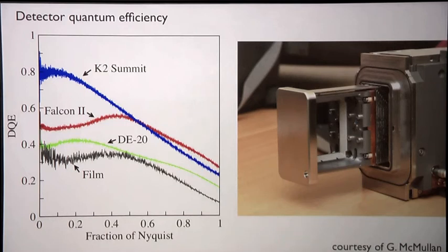I mentioned one other detail. This lower resolution information here is probably quite useful for doing the alignment of particles, and so there may be some advantages to using this one in particular circumstances, but there may be mostly advantages to having the high frequency information here. But as these get better and better, which they will, these curves are going to go all the way up near 1, and Richard promises me that we're going to be up here soon, so that will be very exciting.